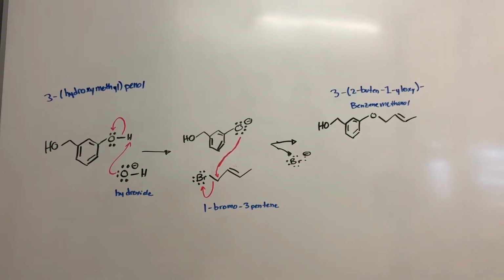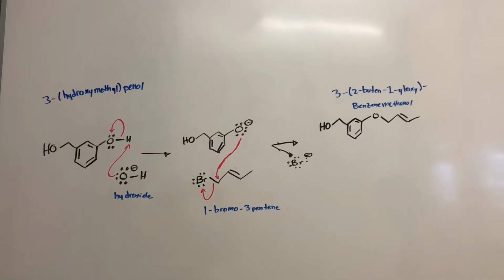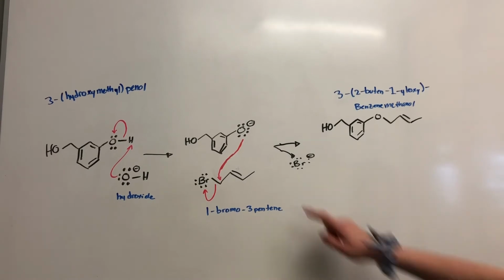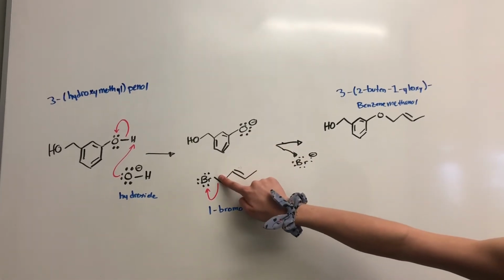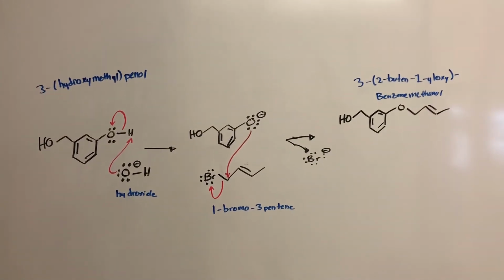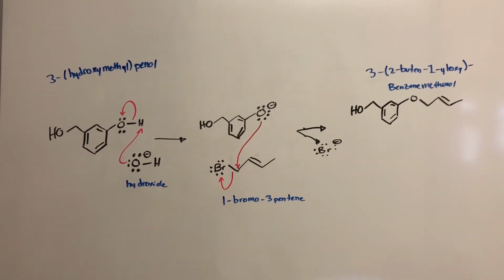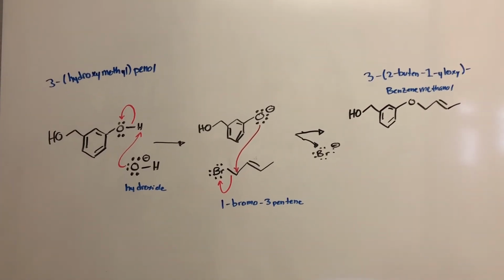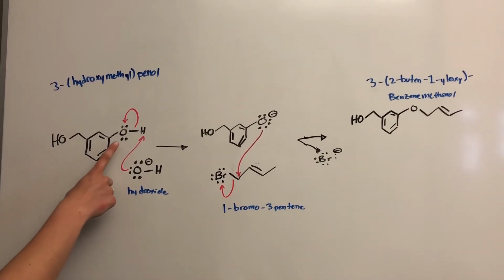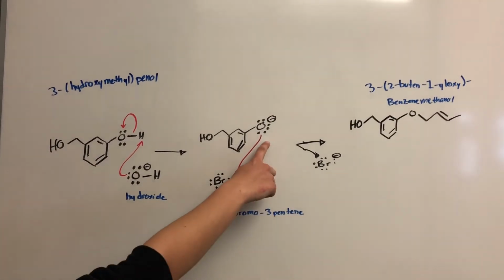In this reaction, you will want to avoid having excess sodium hydroxide in the reaction mixture, otherwise the nucleophilic attack of the phenolate to the alkyl halide will not happen. A concern that you might have is what is the appropriate amount of sodium hydroxide during the workup of the Williamson? There needs to be an excess of sodium hydroxide to ensure that the base deprotonates the phenol. This ensures that all the phenol has become the phenolate.